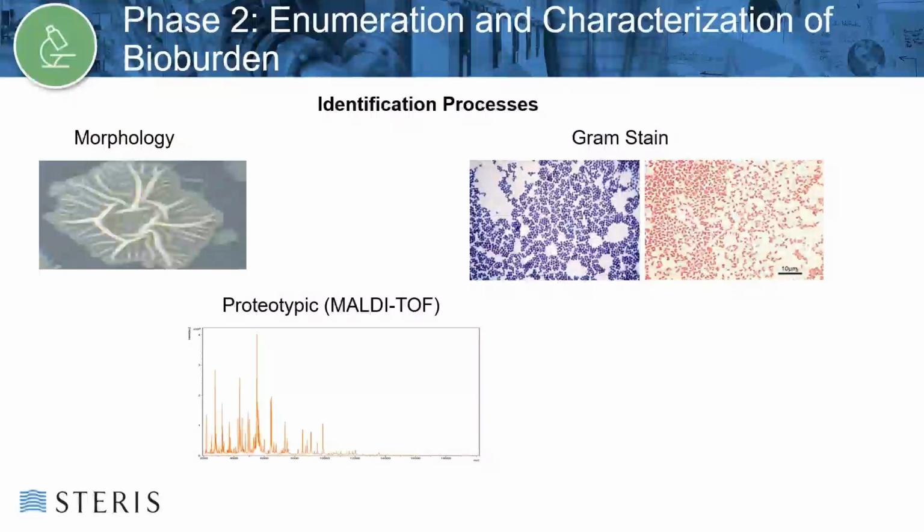The most basic forms of identification are selective culturing, colony morphology, and gram staining. Selective culture uses select media, heat shocking of extract, or incubation conditions to detect certain types of microorganisms. Colony morphology gives a visual description of the colony's growth characteristics, such as color, shape, and consistency. The visual description helps to classify observed phenotypes over time when coupled with further identification processes, such as gram stain, and it can give insight into the possible genus or species recovered.